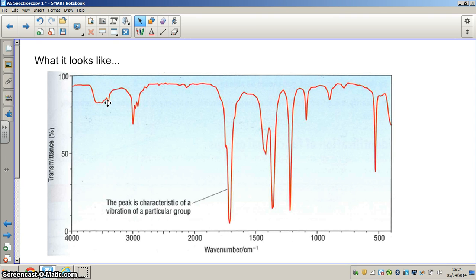In other words, some of the energy is taken into the molecule to cause the bonds to vibrate. And then as we move up the IR spectrum, it stops vibrating, and then a different part of the molecule bonds or starts to vibrate, and then doesn't, and then again a vibration, and all the way through to the end of the spectrum.